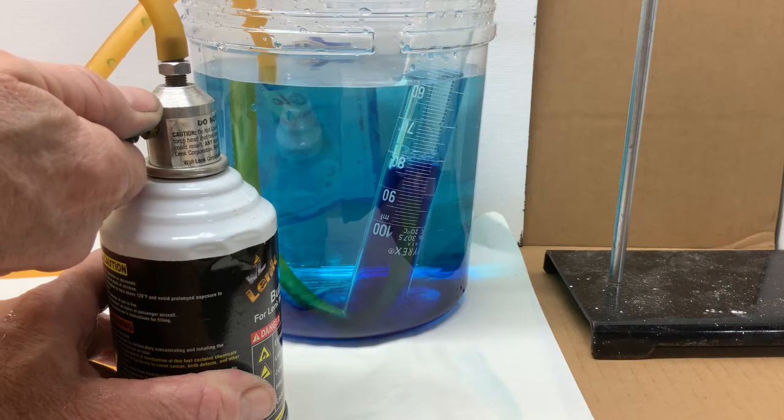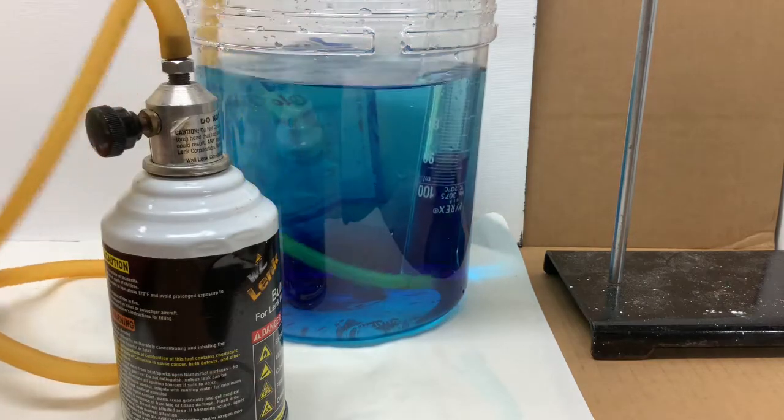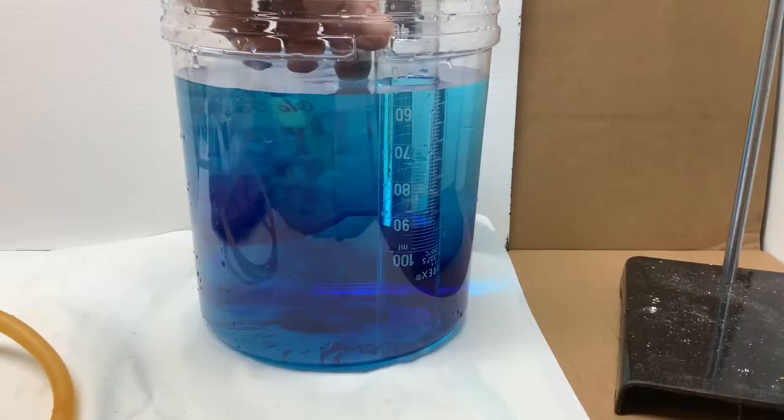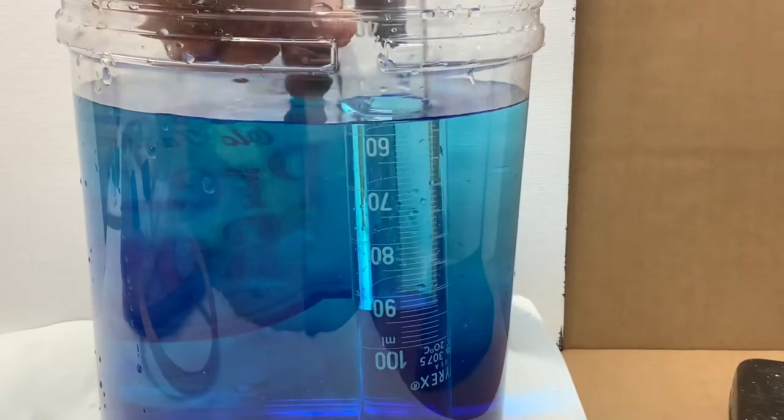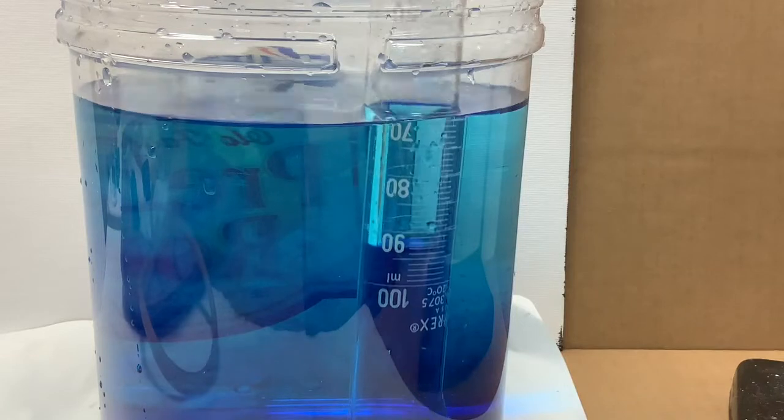Then I'll remove the hose. Don't want to go beyond that hundred mil mark. Remove the hose and bring the apparatus a little bit closer so you can make a measurement of the amount of water after we level the water inside and outside of the grad cylinder.